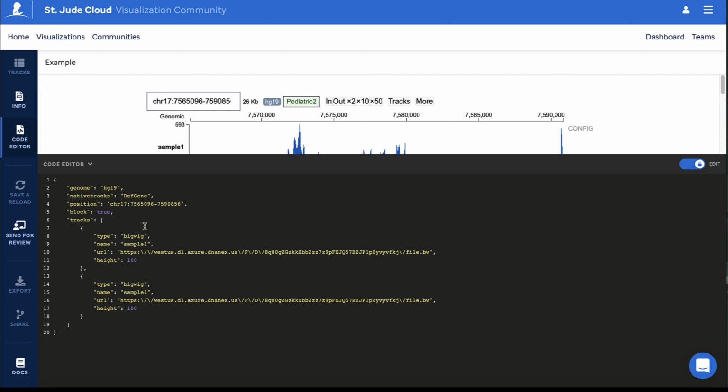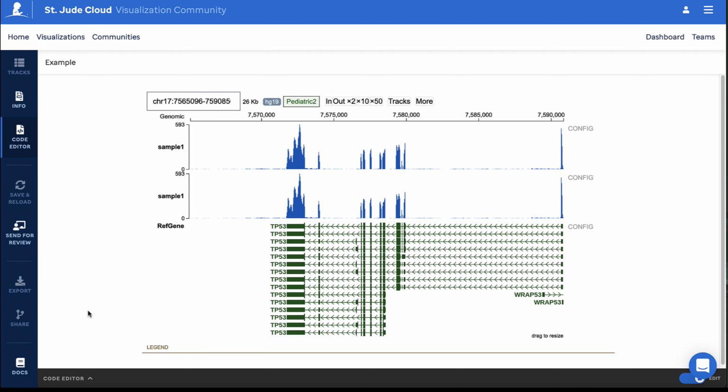We encourage this step for advanced users or those who want to learn how to further customize with ProteinPaint's exceptions and custom features. As you save and reload, you will find that a linter runs in the background to provide partial validation. You can minimize the code editor as well to view the full visualization.